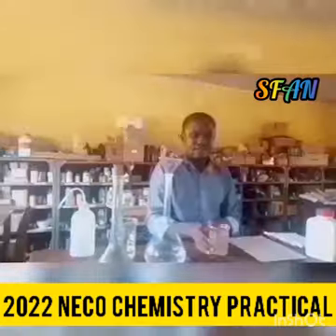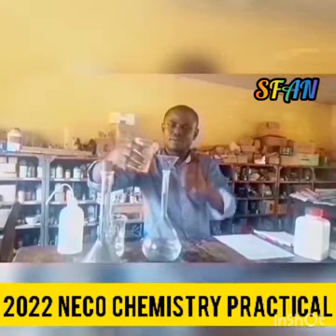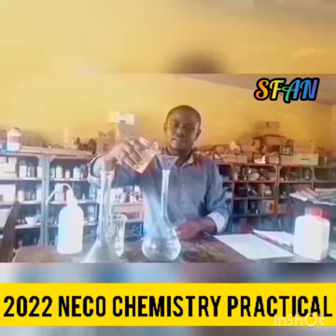And then I'll transfer to the volumetric flask.